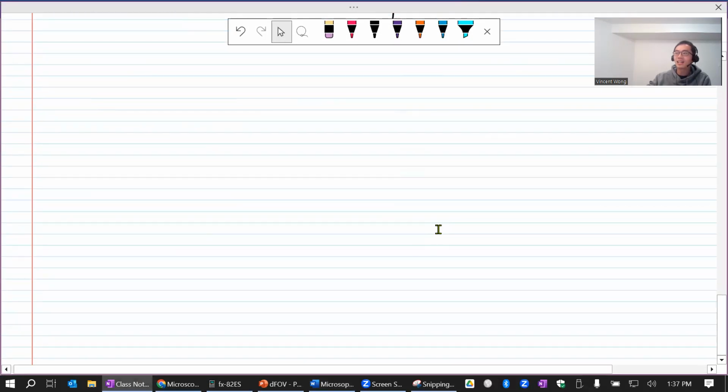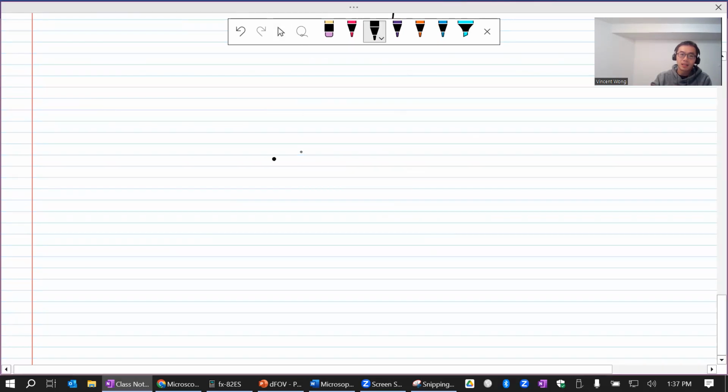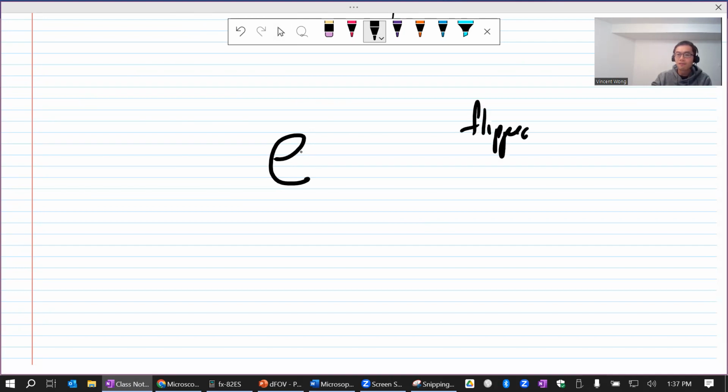because I want you guys to really understand what it is that you are explaining, right? Okay, so let me try this again. This is the original, right? I hear a lot of people say it is flipped. Flipped is not correct, because you can flip it like this, as in flipping a page of a book, or you can flip it like this, as in flipping one of those desk calendars, right? So these are both flipped, but neither of them is the right answer. The image looks like this.